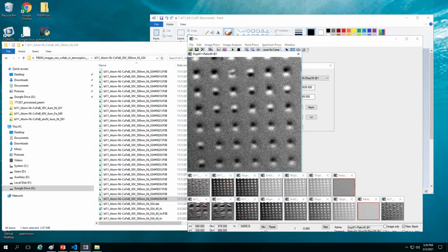Earlier, the version we had, it's showing some glow and some 3D effect, and these are usually due to the alignment, because when you look at magnetic images, they should not show any topographical effect, so it should not be showing, oh, there's a 3D like structure. So this is much better than what we had, and I would actually replace what we have earlier.